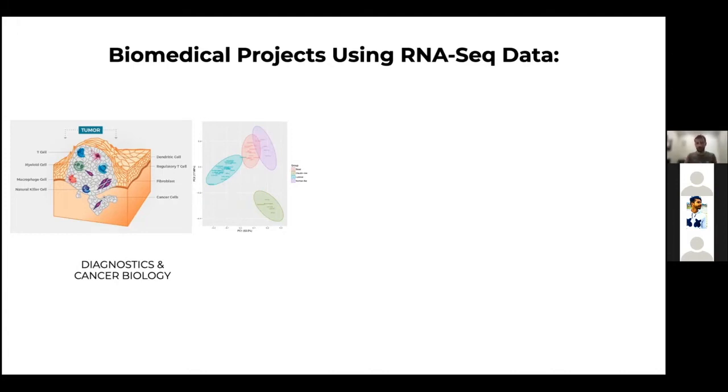So to talk about this challenge, we'll talk about PDX models, which are patient-derived xenograft models, models that are mice, they're animals, but they have a human tumor that is engrafted in them. And because of that, using the simple mapping technique, we could differentiate between the microenvironment, which is essentially mouse tissue, and the tumor, which is human tissue.